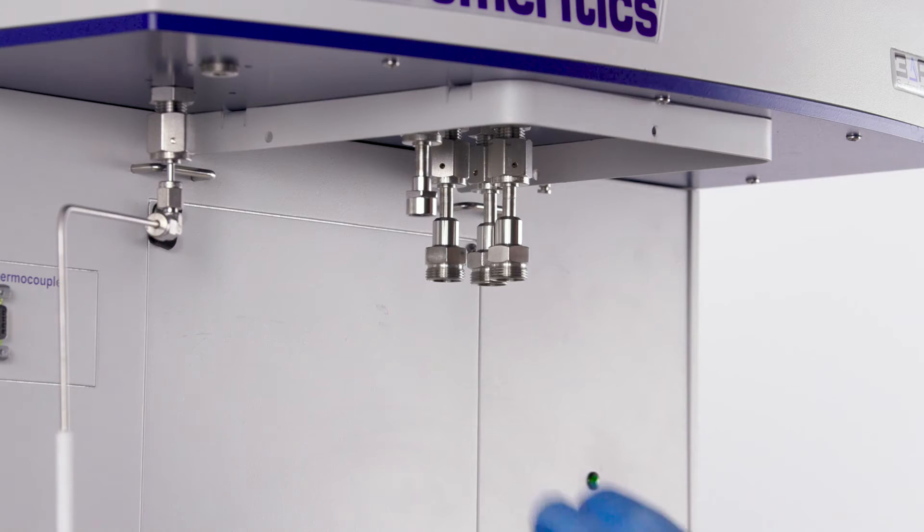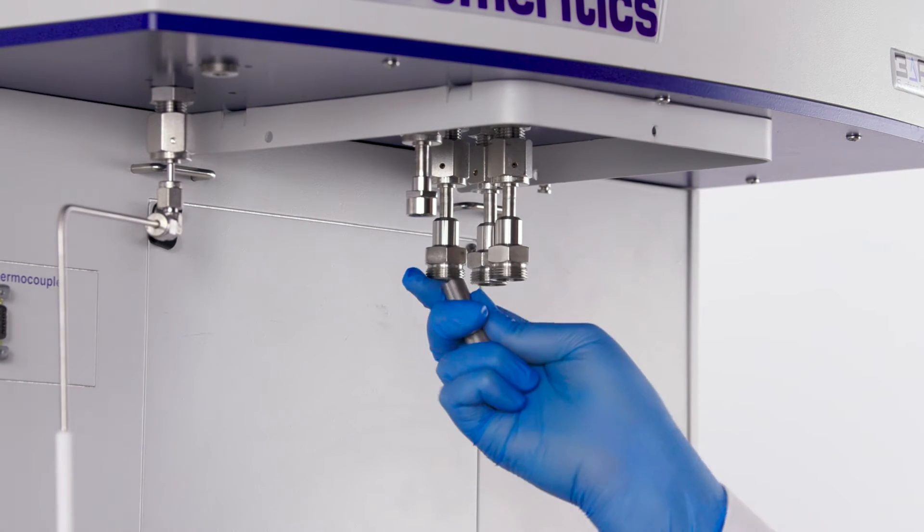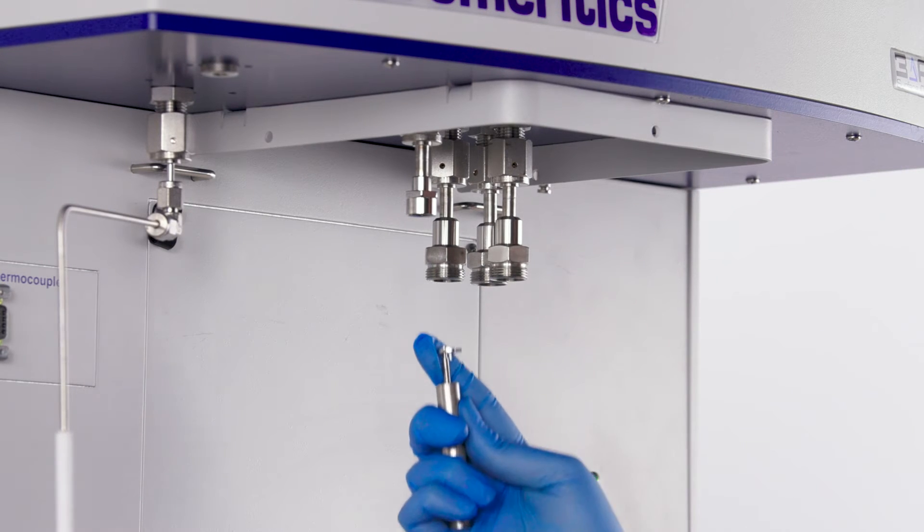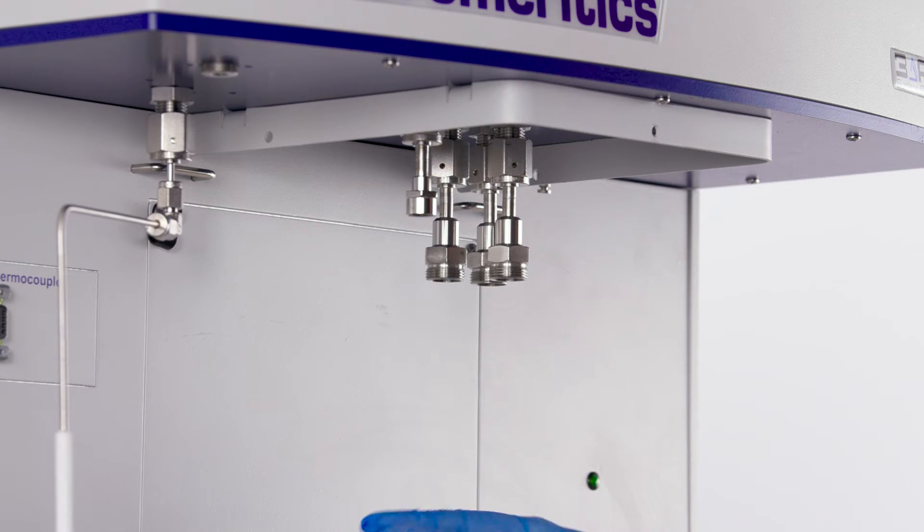Before loading the sample tubes, ensure the sample ports are free of pins that are used for check seals. Remove pins with a pin extractor if necessary.